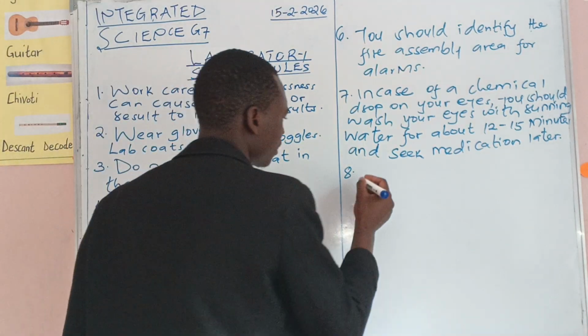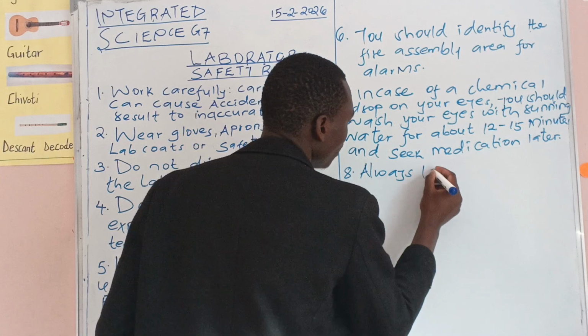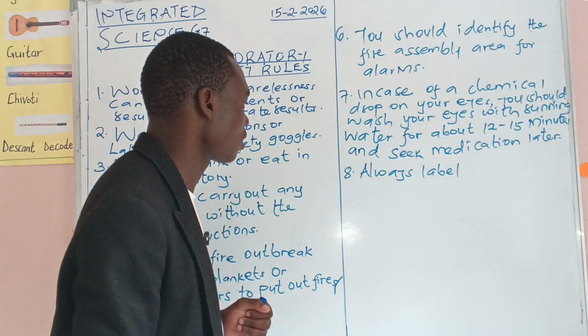Now, another thing you need to do: always label. You are supposed to provide labels.